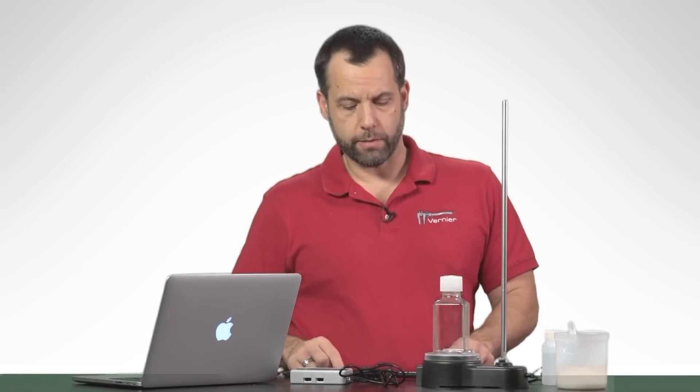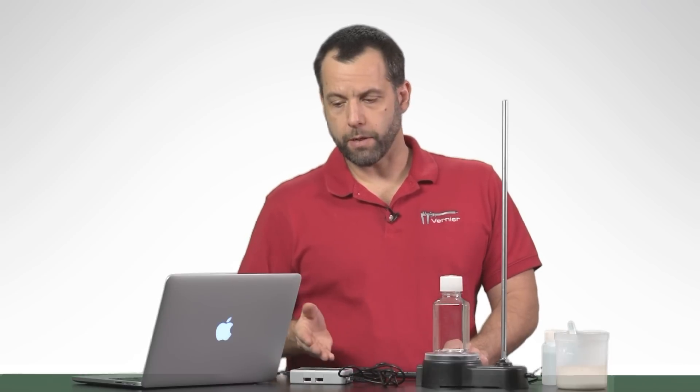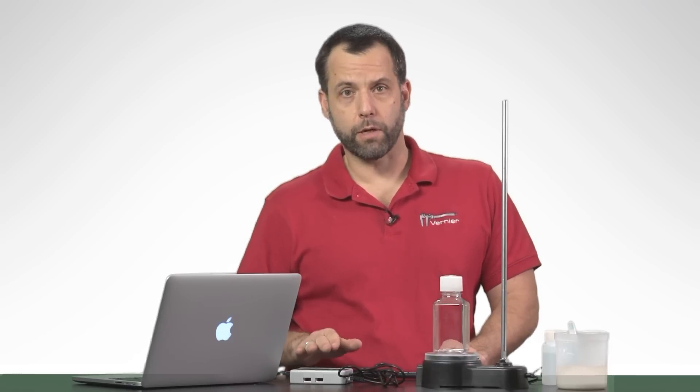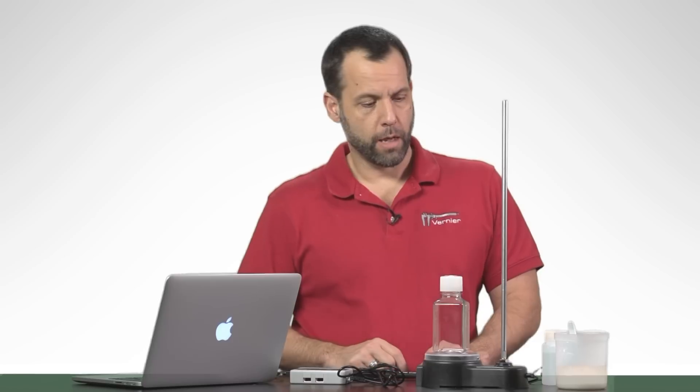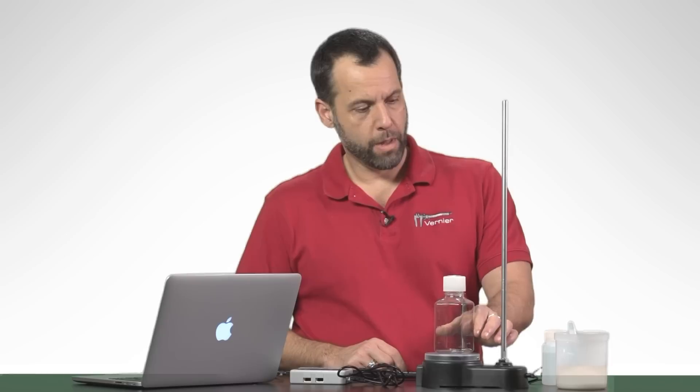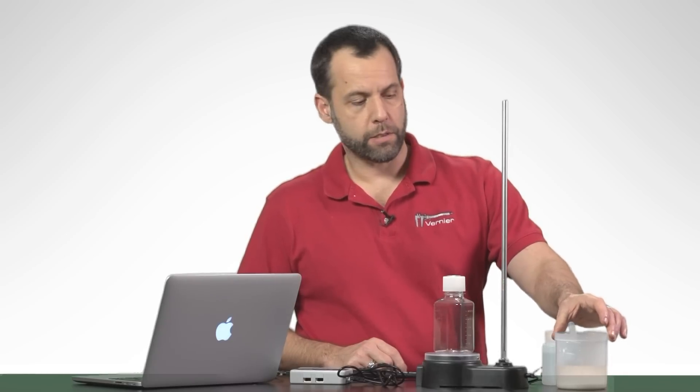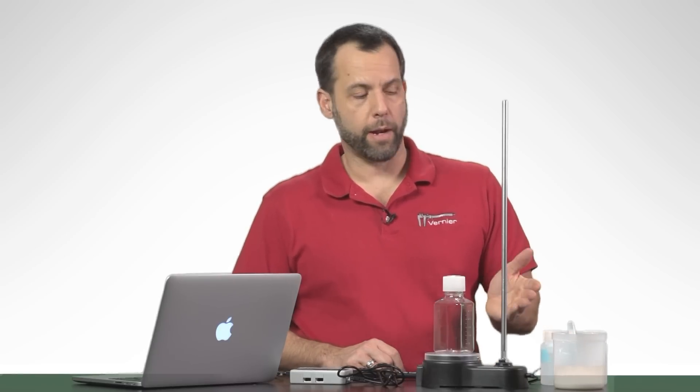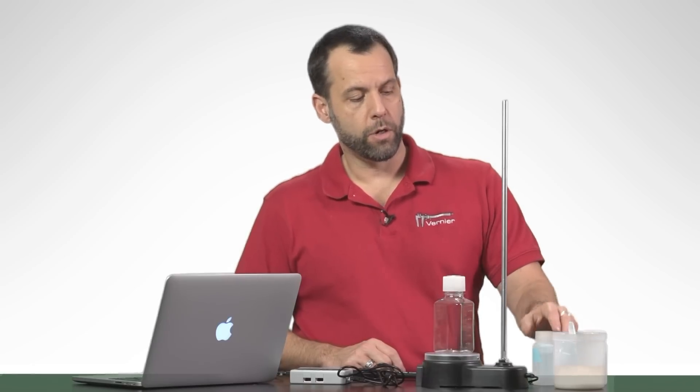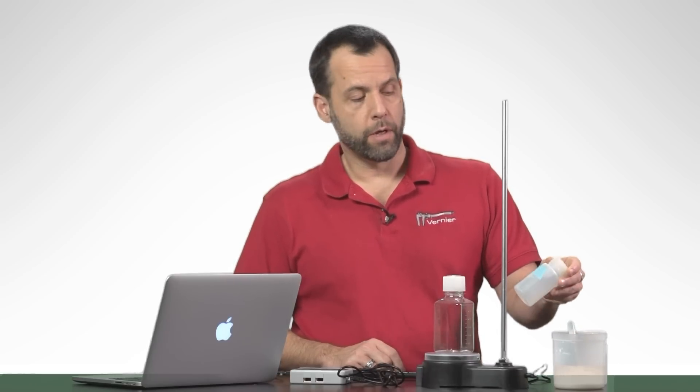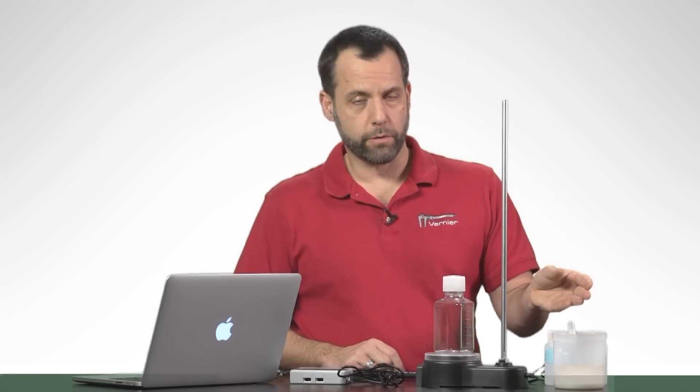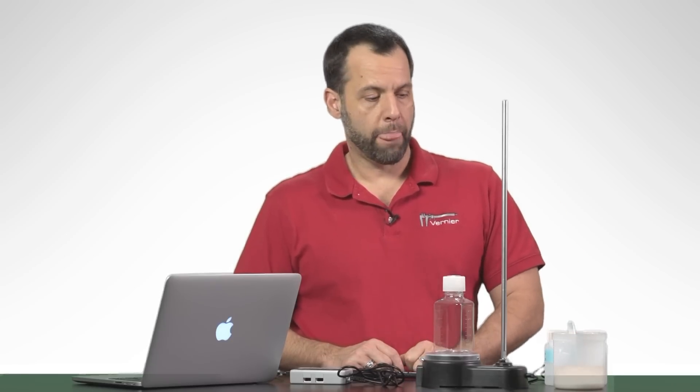All that you need is a Vernier ethanol gas sensor, something to collect the data with—in this case I'm using a LabQuest Mini and a computer—and then my little fermentation chamber, which is just a little Nalgene bottle. I have some yeast that I've mixed up and a solution of glucose. The actual lab instructions will tell you how to mix up the proper solution of yeast and glucose, fructose, or lactose solution, whatever you want. I'm just going to show you how to quickly do this experiment.